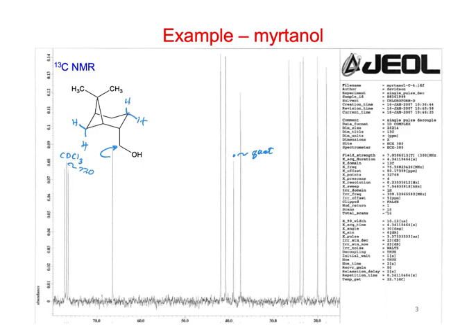One of these is probably feeling more steric issues. I think these are probably the closest together right here, so that one might be more shielded.